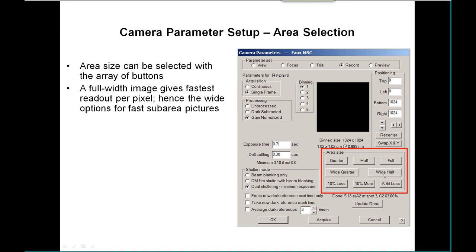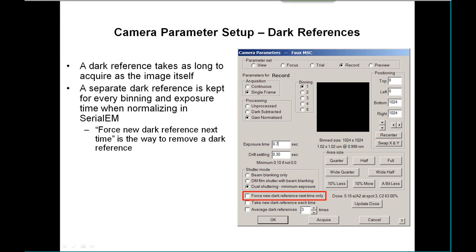Once you have a sub-area selected, you can actually move it around or recenter it with these arrow buttons, which is handy when you're doing low-dose focusing and you want to move the focus area over to another more tempting bit of information.